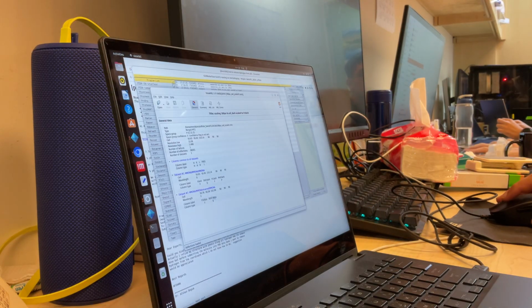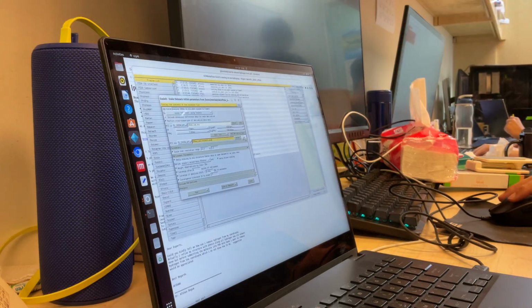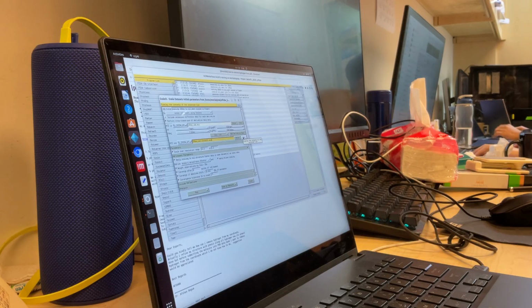What he has is F dark and sig F dark, FC dark and phi C dark, and F 180 picoseconds, sig F 180 picoseconds. I'm talking about if you need to modify the name of the variables in the scripts. But he can show it to you later as well. If you can give him a hand with that part, that would be awesome.